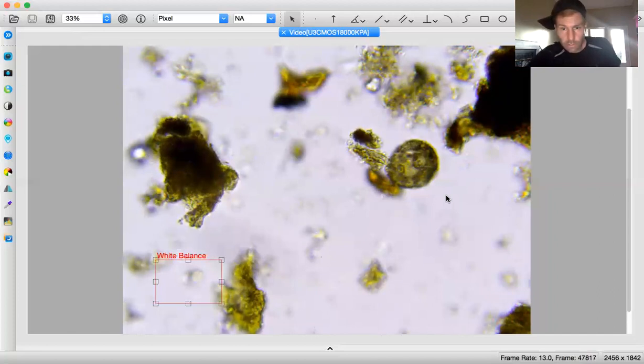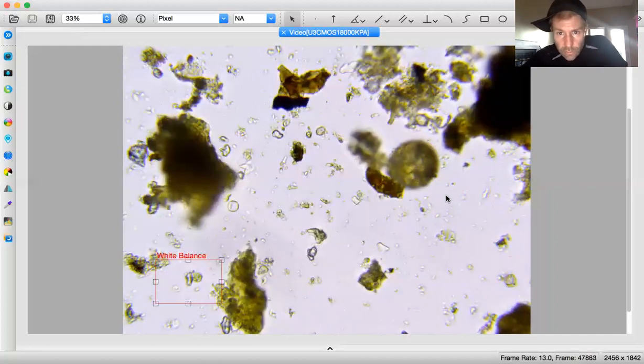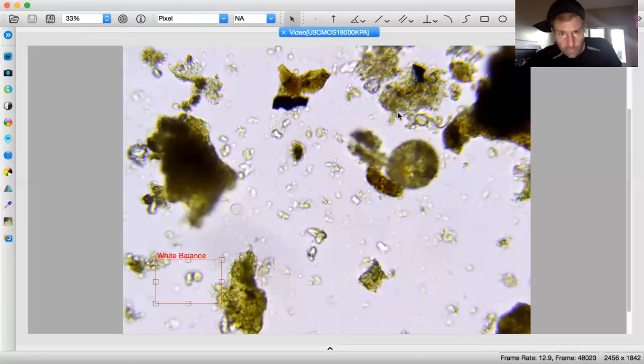So one amoeba. Looks like a few things to record in this. That looks like a fungi break, but I can't see the end of it here. So all we can record is that little tip, and that looks like a 0.025 is what I'm going to record that as.